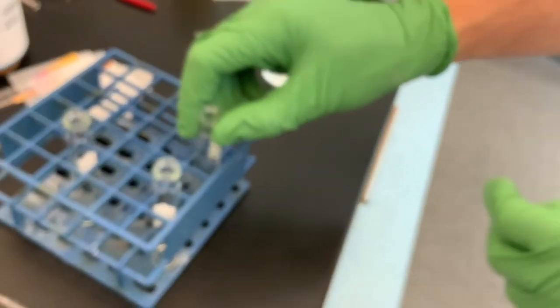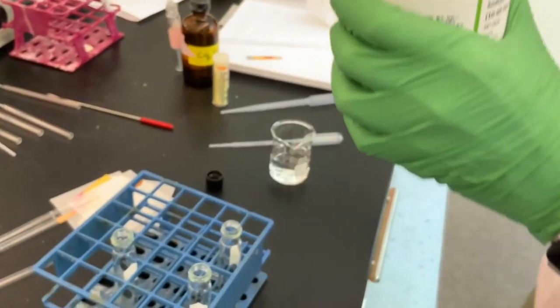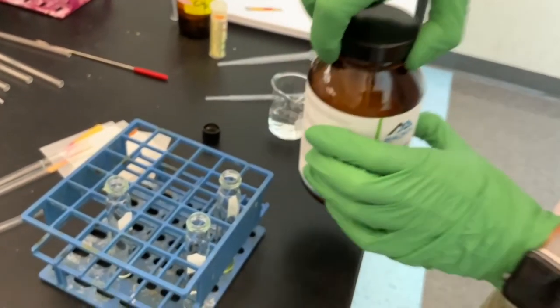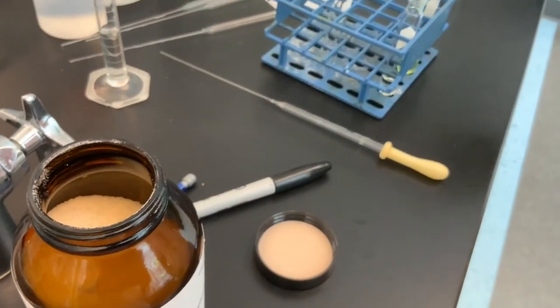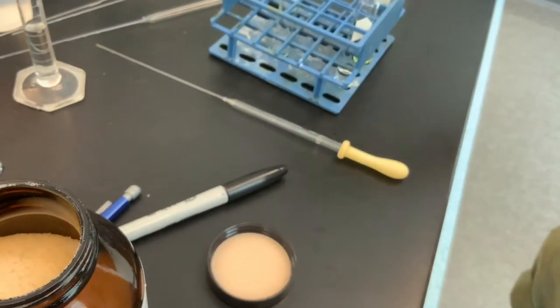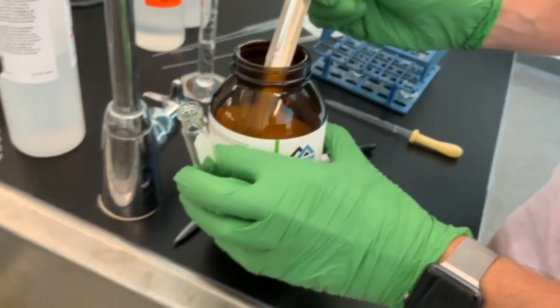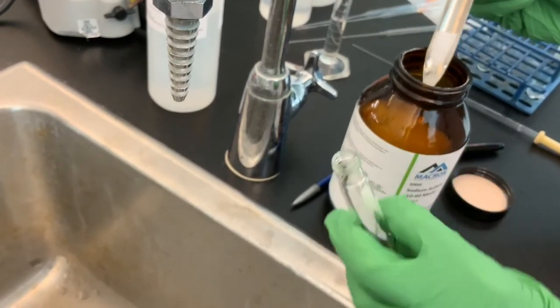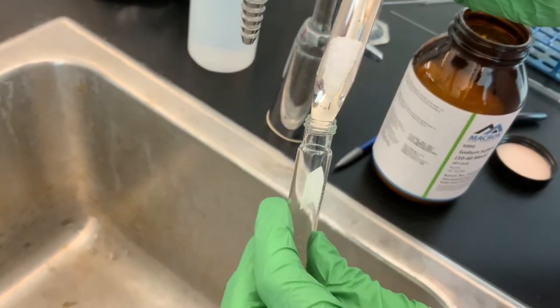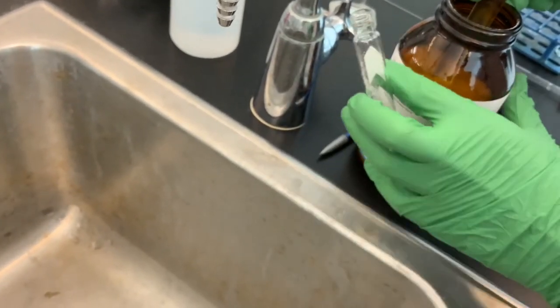So we're going to use anhydrous sodium sulfate. I'm going to use a scoopula to add this. I do it over the sink just in case I spill some sodium sulfate. Right, and I already know that that's not going to be enough.